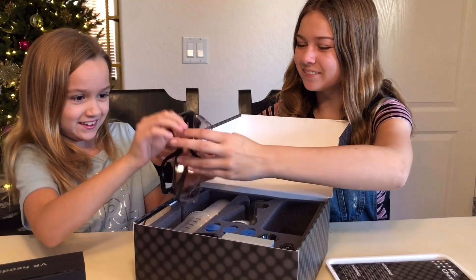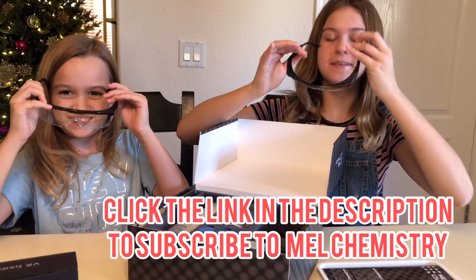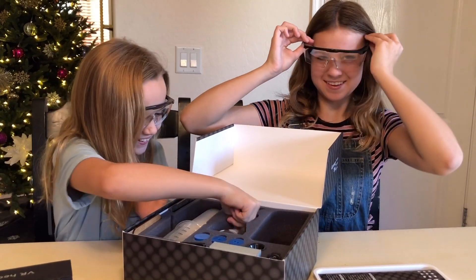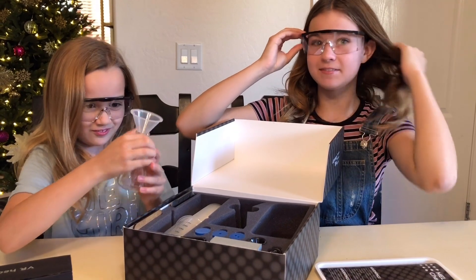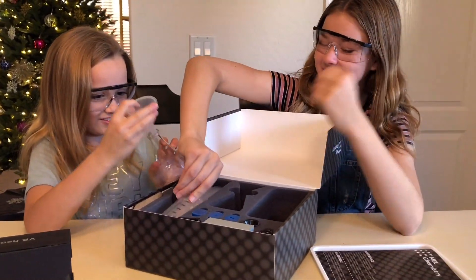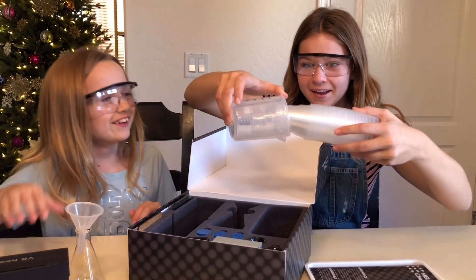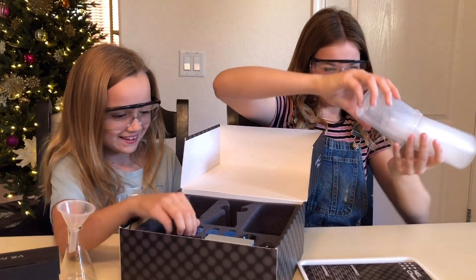We each get our own pair of safety goggles. There's a very scientific beaker and lots of cups.